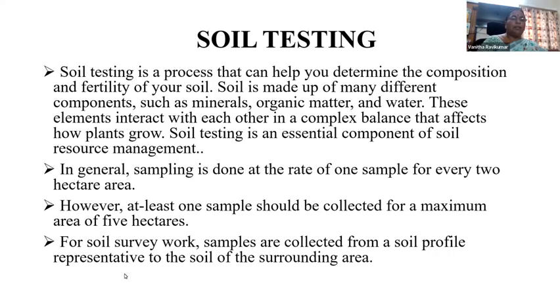The soil sample mainly differs according to the texture and color of the land, and according to the bedrock, that is, the profile can differ in soil testing. For every soil profile, you can take different soil samples.